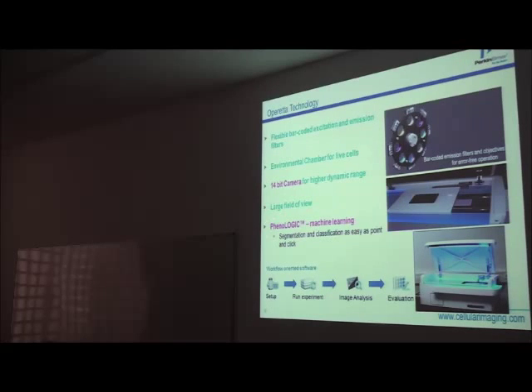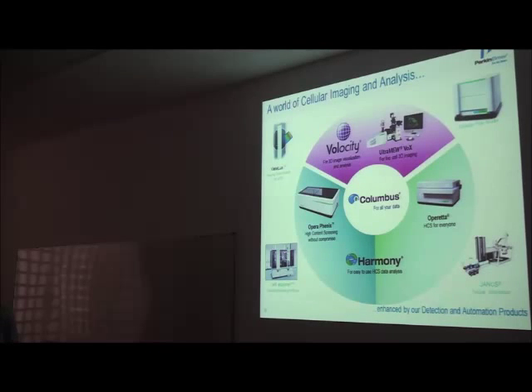And now we use another way for the analysis, which is called PhenoLOGIC, but that's something you're probably going to look at later on. It's just a machine learning concept. So you teach the software how to recognize the phenotype that you are interested in, and then the software will do it later on. So it's much easier than what we usually do.